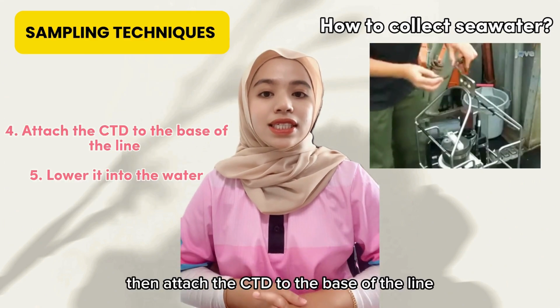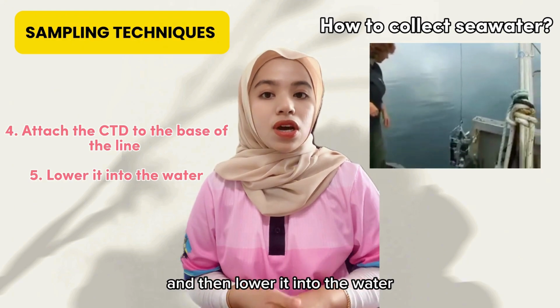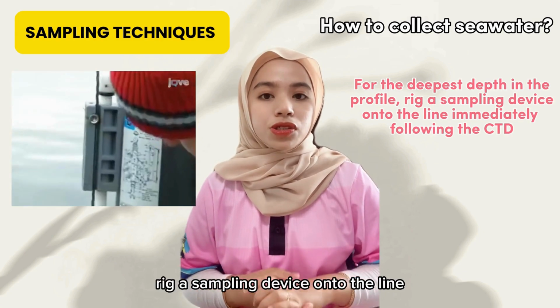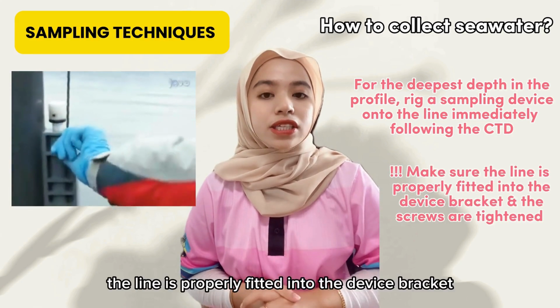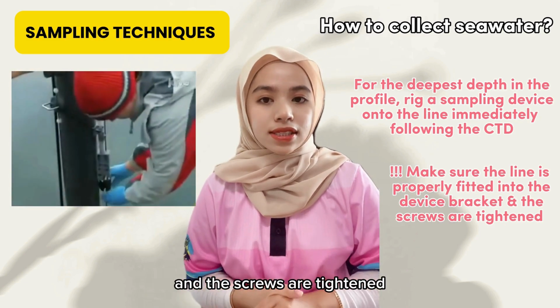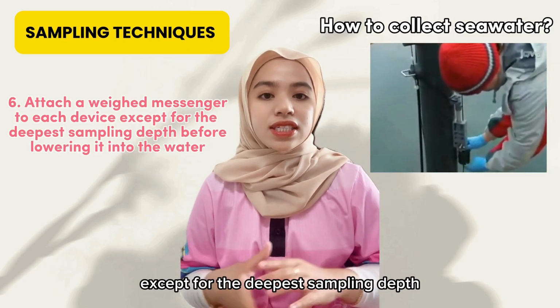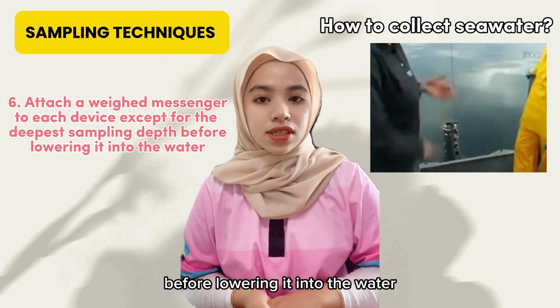Then, attach the CTD to the base of the line and lower it into the water. For the deepest depth in the profile, rig a sampling device onto the line immediately following the CTD. Make sure the line is properly fit into the device bracket and the screws are tightened. Then, attach a weight messenger to each device except for the deepest sampling depth before lowering it into the water.